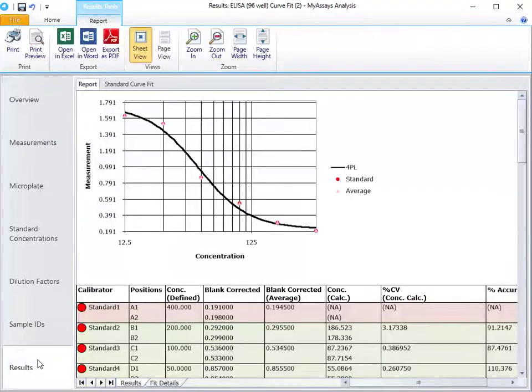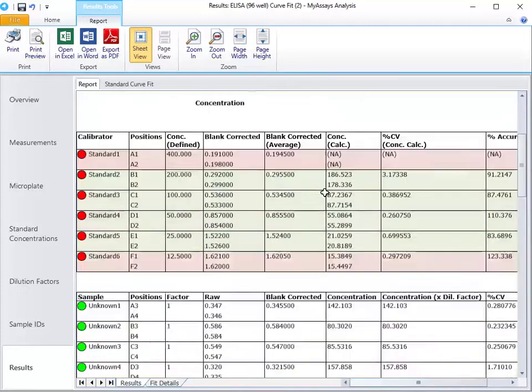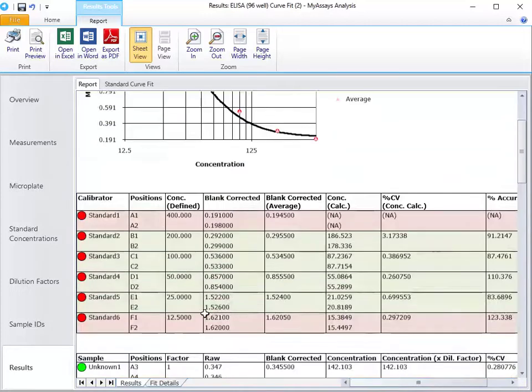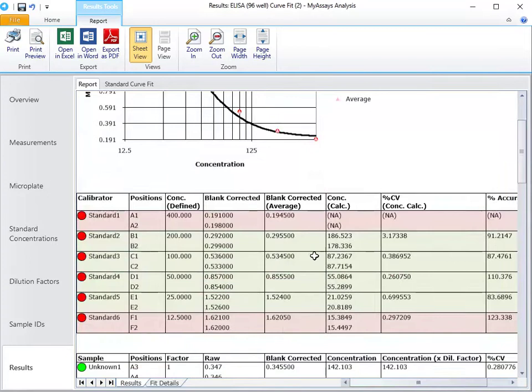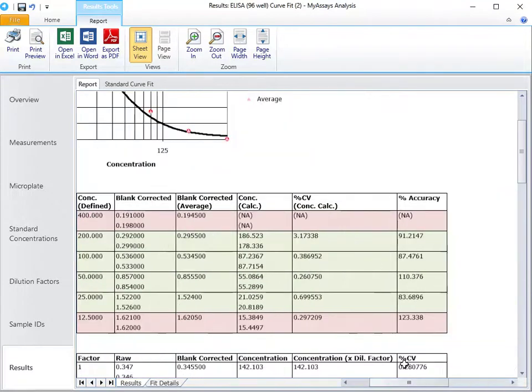On the results tab, you'll see our curve fit chart appearing first, followed by the curve data table. This displays the standard results with red and green coloring based on acceptability criteria set for the percent CV and percent accuracy, or recovery.